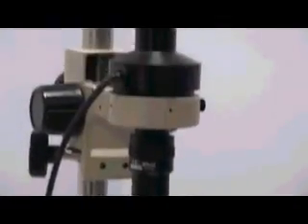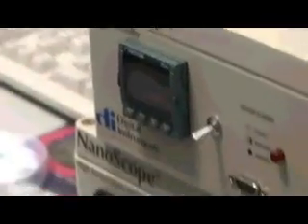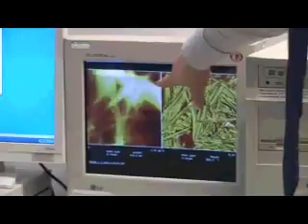Because nanotechnology is not just about small sizes, it's about small forces or anything that's in the sort of nanoscale. So we actually measure, for example, the forces between individual molecules. So say when two proteins come together, if you think about an antibody, that sort of Y-shaped molecule grabbing something, we can measure those forces. So this microscope here, which actually looks quite small, doesn't look sort of massive or anything, has the power to see individual atoms or individual molecules, and it can do it in liquids, which is the key thing for us.